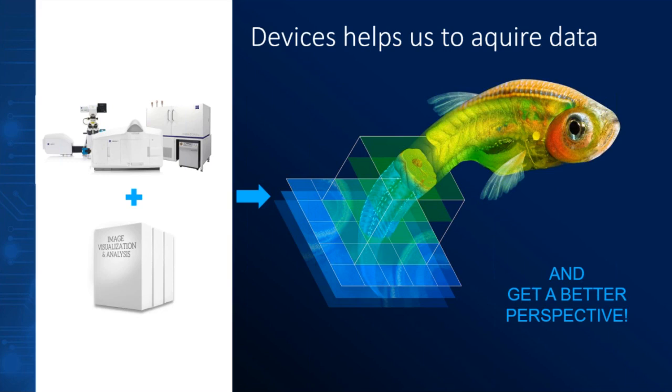Well, number one, we start with the instrumentation that creates the imagery. And nowadays, as I said, we're seeing smaller and smaller objects, more and more resolution, more complete views of the material that we're interested in studying.